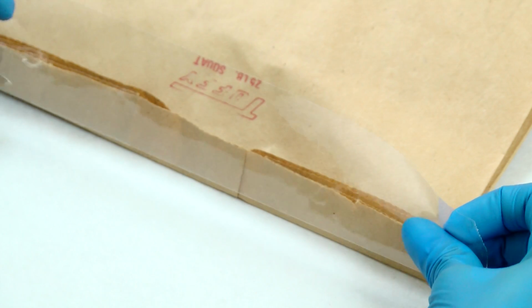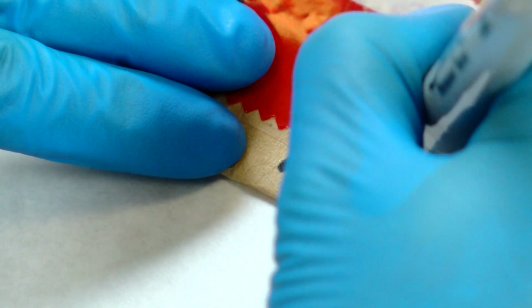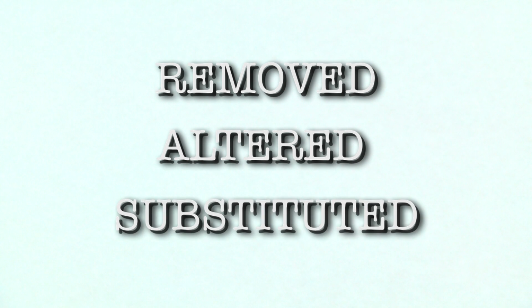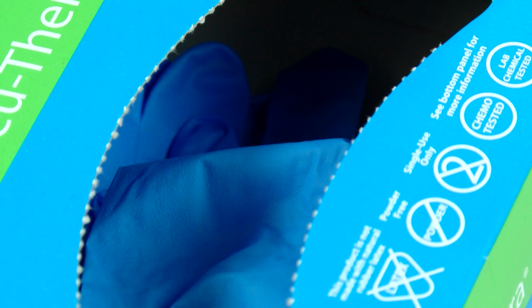If using a paper bag, fold the top of the bag and seal with tape from end to end. Write your initials in permanent ink on the seal. Write the agency case number on the outer packaging. Sealing items properly will ensure there is no possibility the package contents can be removed, altered, or substituted without the seal being obviously disturbed. For buccal swab collection, make sure to wear protective gloves at all times.